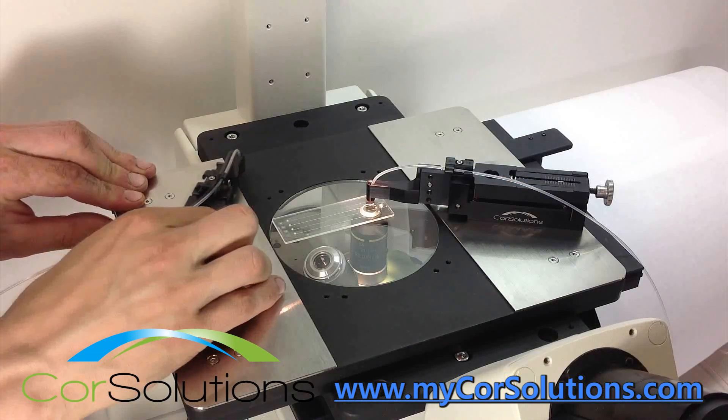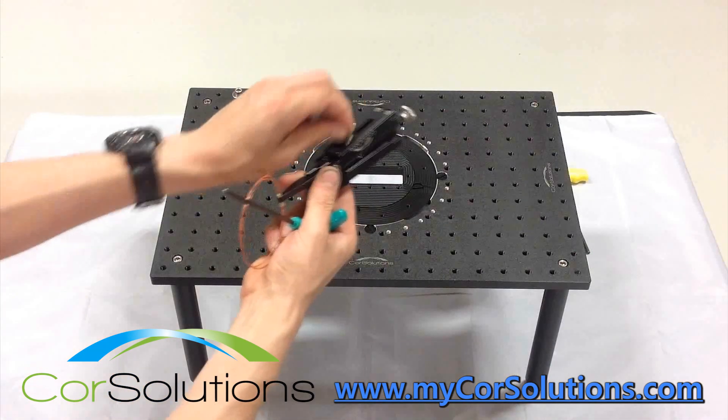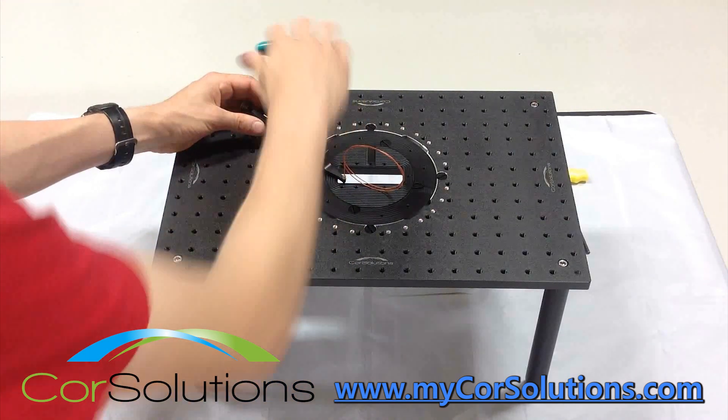Core Solutions Probes can either mount to a magnetic base plate or screw in at a sliding and pivoting attachment point. Both user-friendly mounting mechanisms allow for easy manipulation of the probe on the mounting surface.